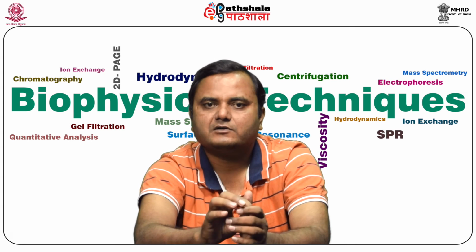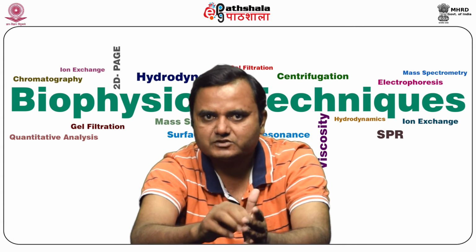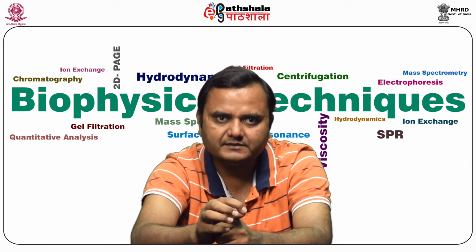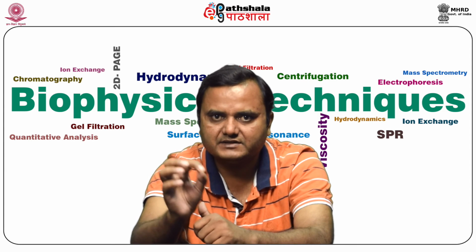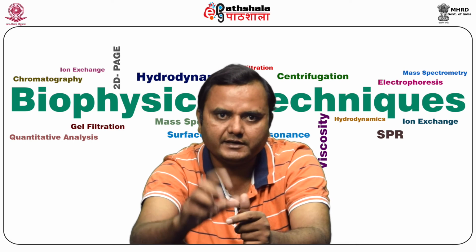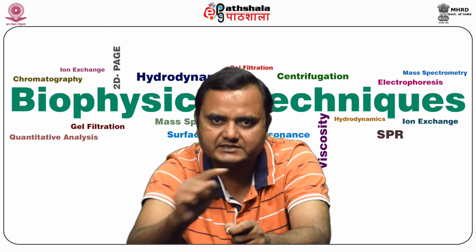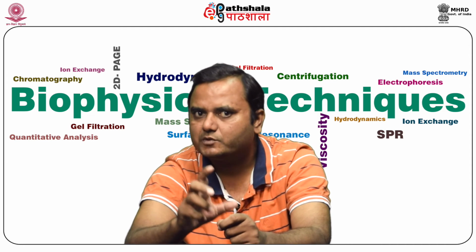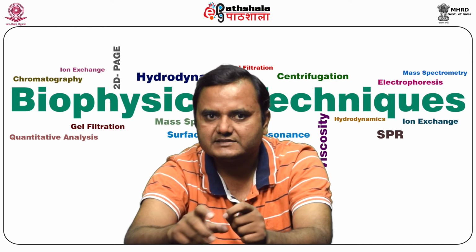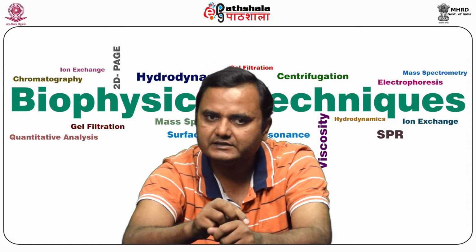So we'll discuss the isopycnic centrifugation process. In the isopycnic centrifugation process, the density range of the gradient medium encompasses all densities of the sample particles. Each particle will sediment to an equilibrium position in a gradient where the gradient density is equal to the density of the particle, meaning the isopycnic position. In this type of separation, the particles are separated solely on the basis of differences in their density, irrespective of their sizes.